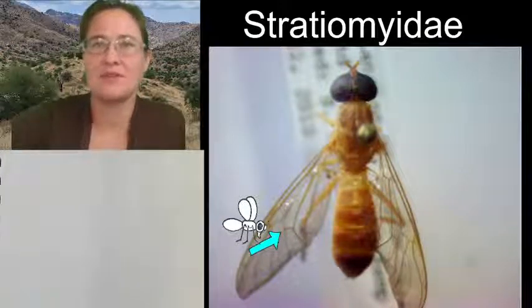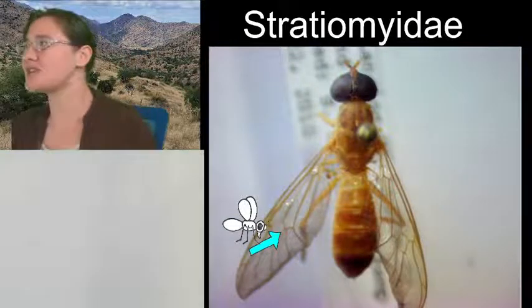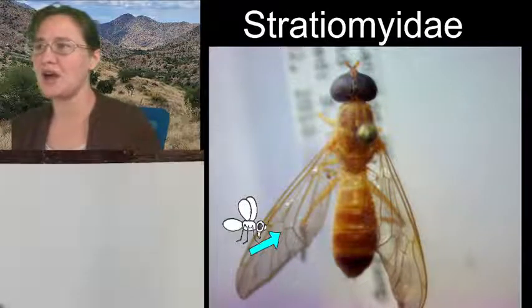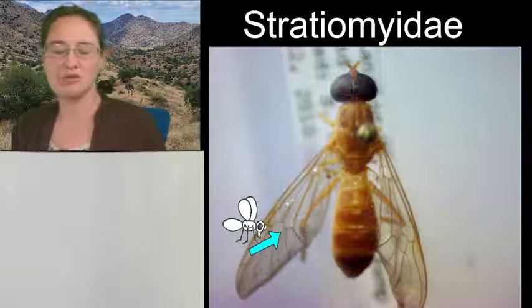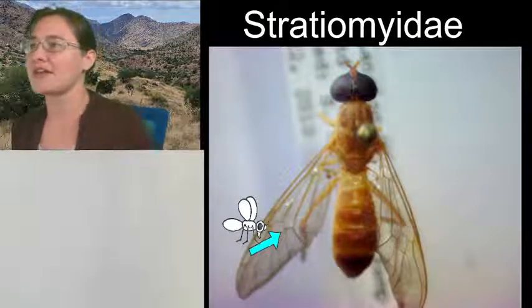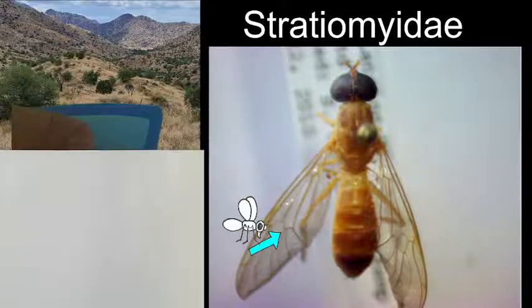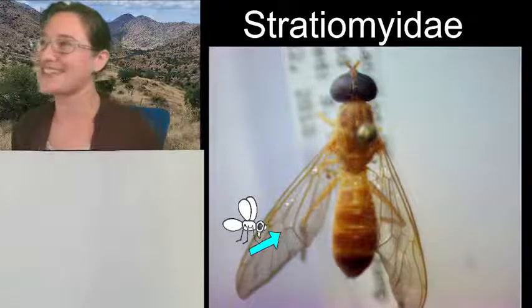Alrighty, so we're going to go ahead and start sketching our fly here. If you have any questions or comments, or you want to zoom in on somewhere else on the body, just let me know. Or if you want me to slow down, I can do that too for you. This soldier fly was collected in 2010, in Lansing, so when I was going to school.